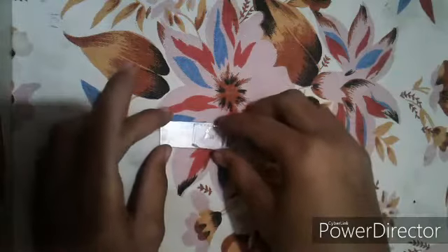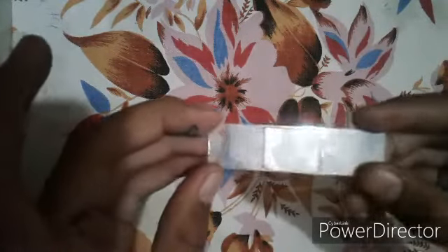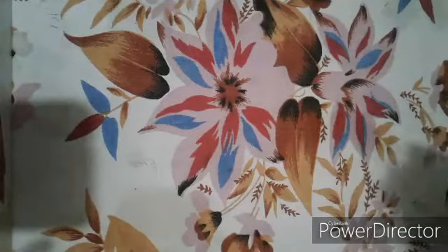This is our stained slide, as you can see. Now we are going to place it onto the glass slide, and our slide is ready. Let's watch it under the microscope.